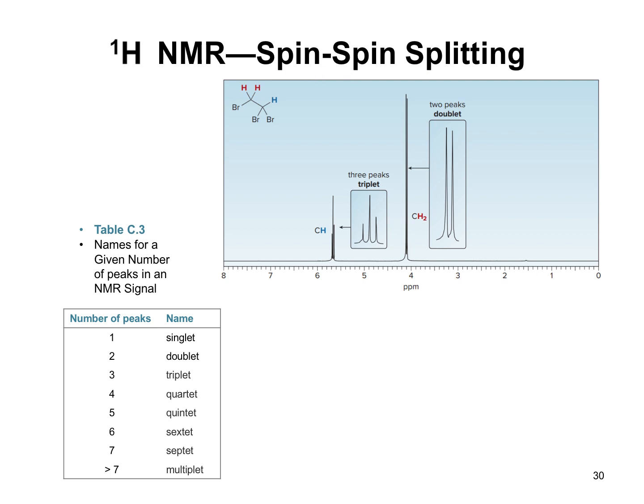Spin-spin splitting only occurs between non-equivalent protons on the same carbon or adjacent carbons.